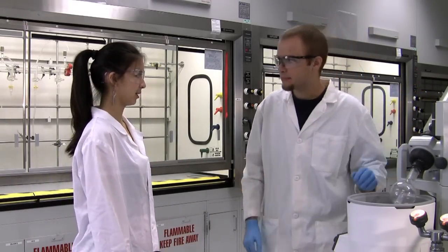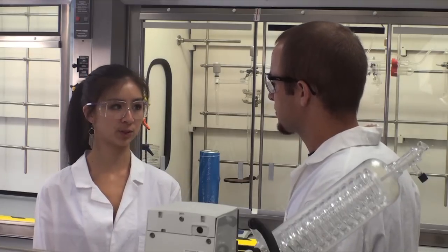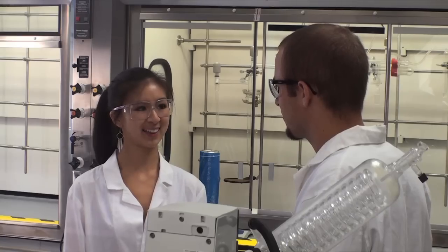Hey Matt! Hey Gidget, what's up? Well, I have to run a reaction with tert-butyl lithium. I'm terrified. Well, you shouldn't be terrified of it. As long as you treat pyrophoric chemicals with respect, you can use them safely. I've worked with it before, and I'll help you out. Great, thanks!